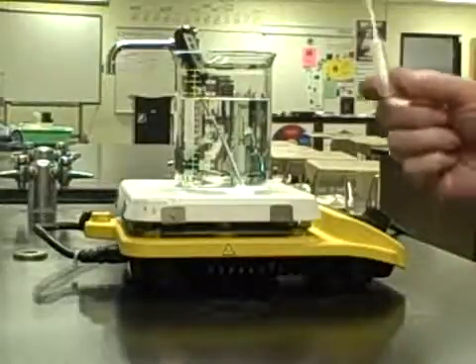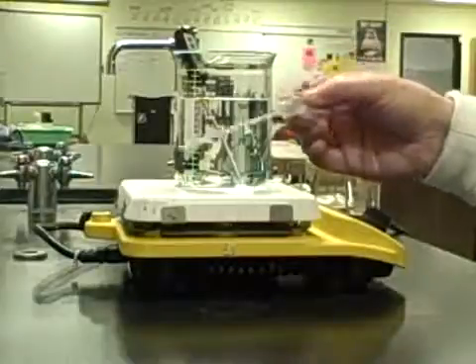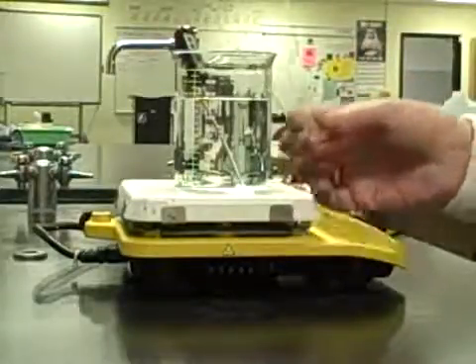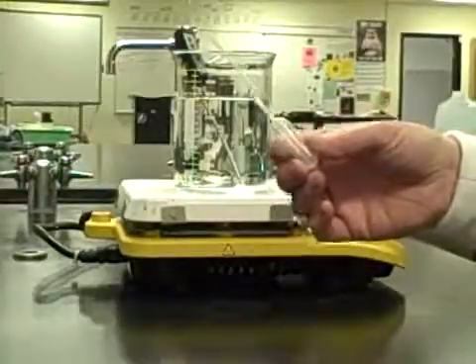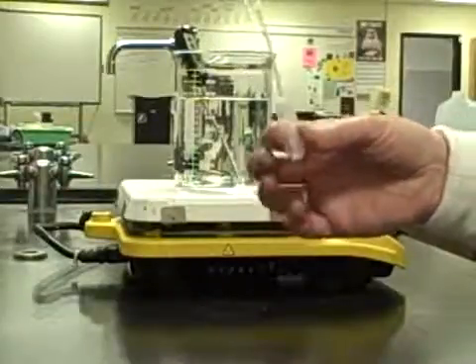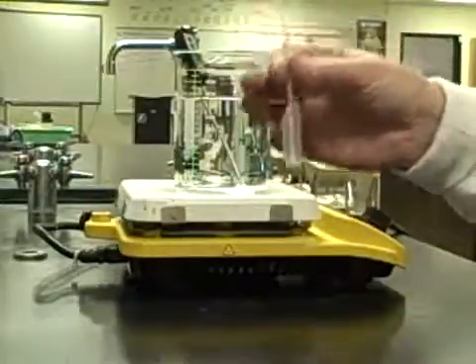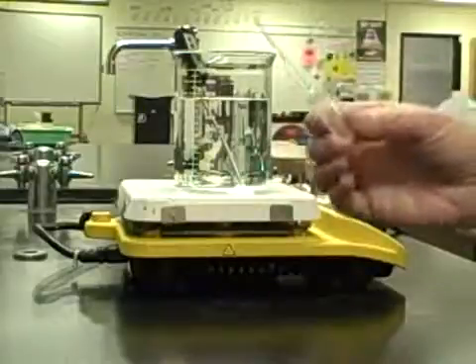Each group is going to pick up a pipette. This is just one of these plastic pipettes that we've used a lot in here. We're going to see how much the gas expands in here when we heat it up in different water baths. Just like Charles Law predicts, and just like we know from our own experience, gases should expand when they heat up. So we're going to allow it to heat up. We're also going to allow the gas to escape through the top, and then we're going to try and measure how much gas escapes. So first thing we need to know is how big is this pipette.